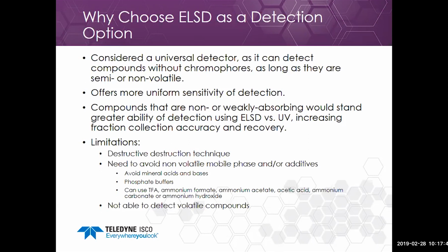This offers more uniform sensitivity of detection, as you're not having the problem of different absorbances at different wavelengths for the compound.